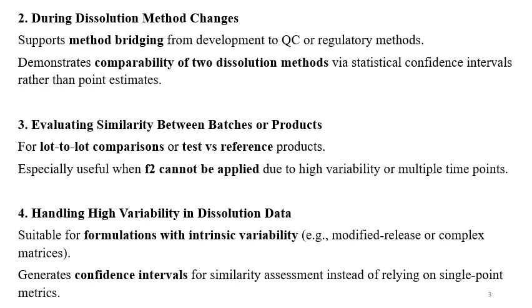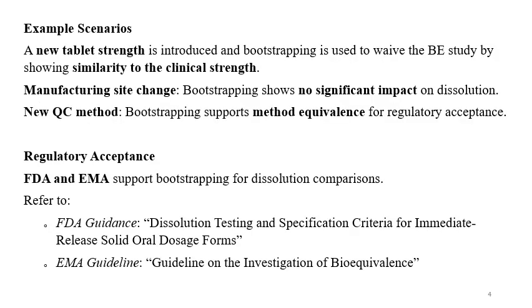You can simply go through the DDSolver software in the Excel and you can apply the bootstrapping method. Generally, the resampling is for 5000 times. You can go beyond that, and you can check whether the dissolution profiles are similar or not via F2 calculation.